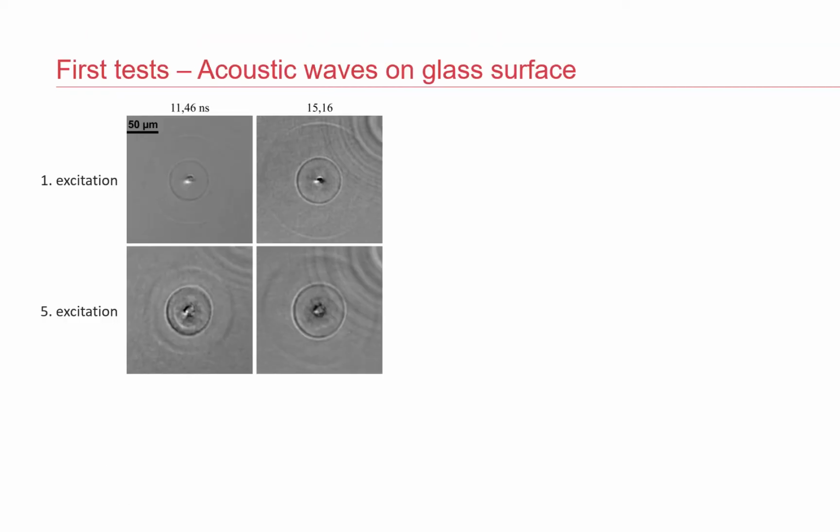Now we are focusing the laser on the glass surface. The images show 2 different delay times, but now the same spot was excited more than 1 time. Doing so enables to widen the wavefront of the outer wave.